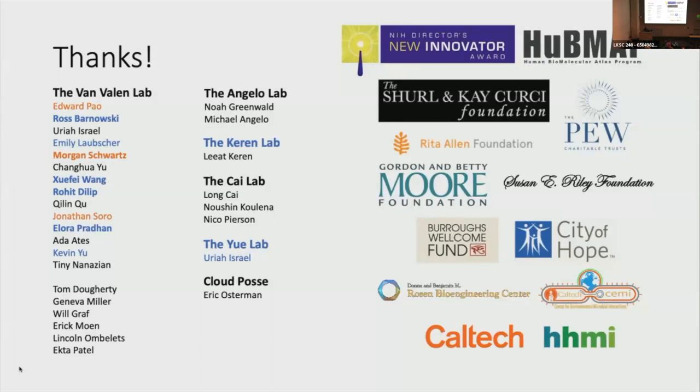Probably. We have not run a rigorous comparison between the proteomic signatures and the transcriptomic signatures, provided that you're measuring the same thing. There are likely to be cases where there's a high amount of correlation. There are likely to be cases where there's little correlation. I think what also muddies the waters are just the feedback loops that exist. And so you can have a causal link between the two without seeing a strong correlation signature. So yeah. Thank you.